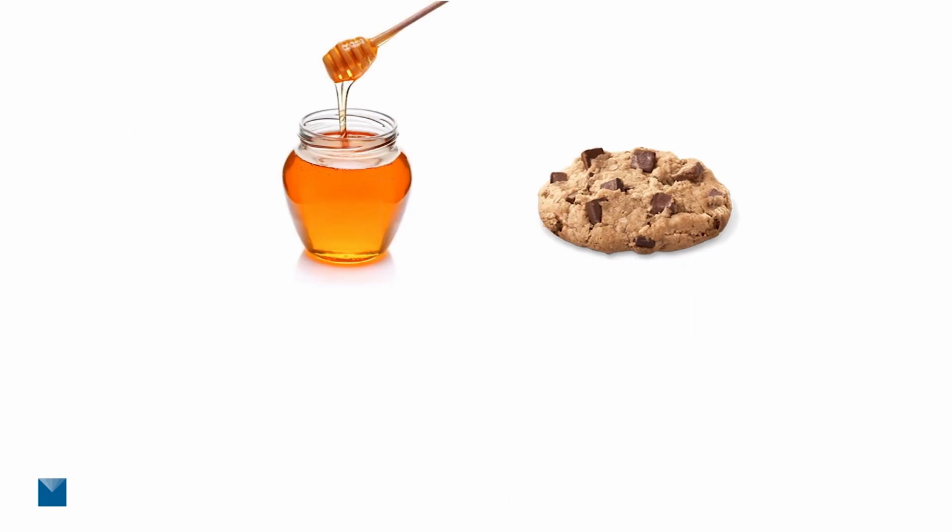All right, we're going to have a little demonstration here. We're going to compare honey versus a nice crunchy cookie. How would you compare the moisture content between the two? Would you expect the moisture content of the honey to be much higher than the cookie? I would say yes, right? The honey is nice liquid and the cookie is nice and crunchy, and you would be right. The moisture content of the honey is around 18%, and for the cookie, it's only 5%.